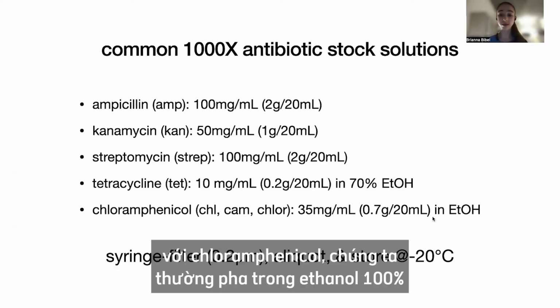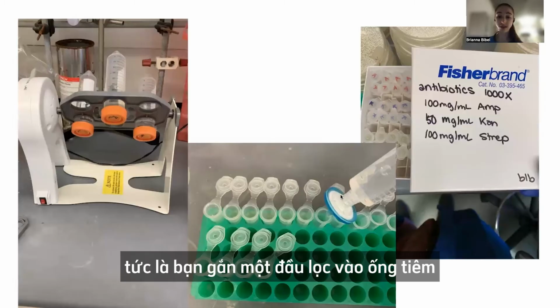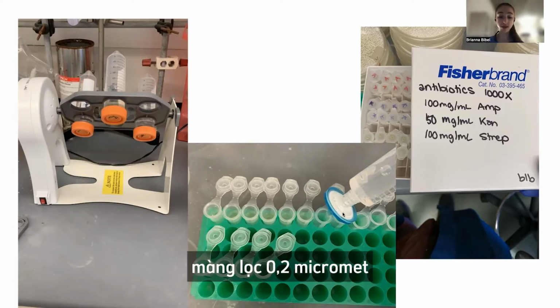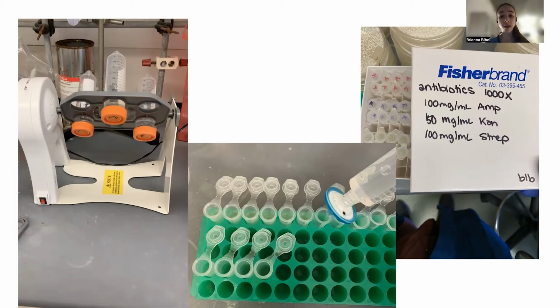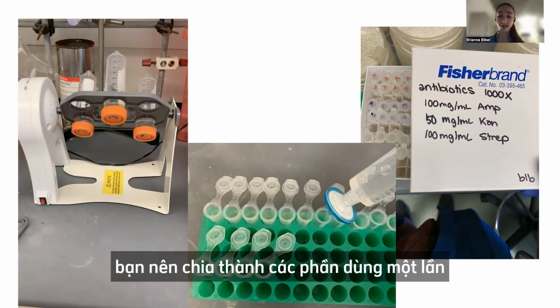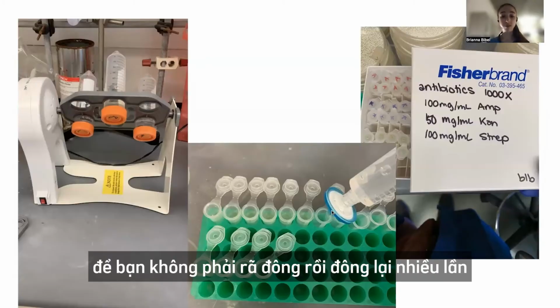With chloramphenicol, we typically make it in 100% ethanol. With all of these, you're going to want to syringe filter it. Basically, you put this little filter on the end of the syringe. It has a membrane with really tiny pores, and we typically use a 0.2 micron membrane, which is going to keep out any bacteria. Then we can filter it into aliquots. You want to make these single-use portions, or at least just a couple of uses, so that you don't have to keep freeze-thawing them.